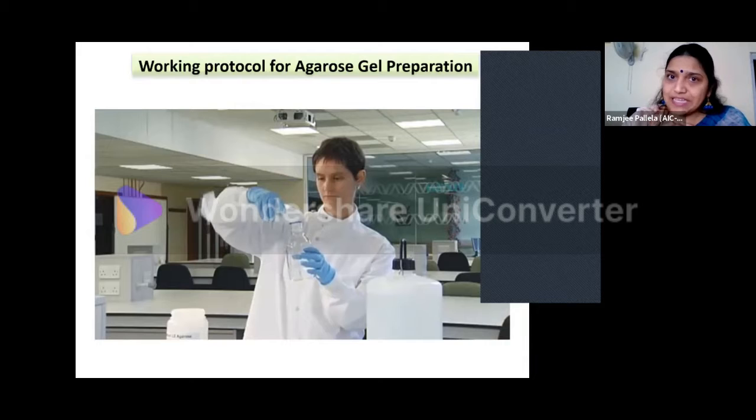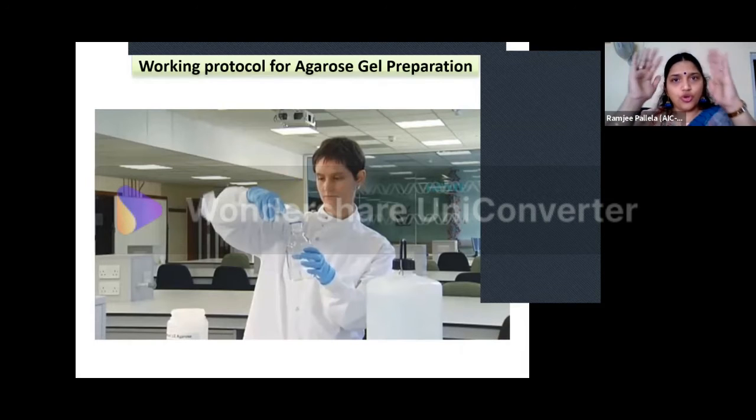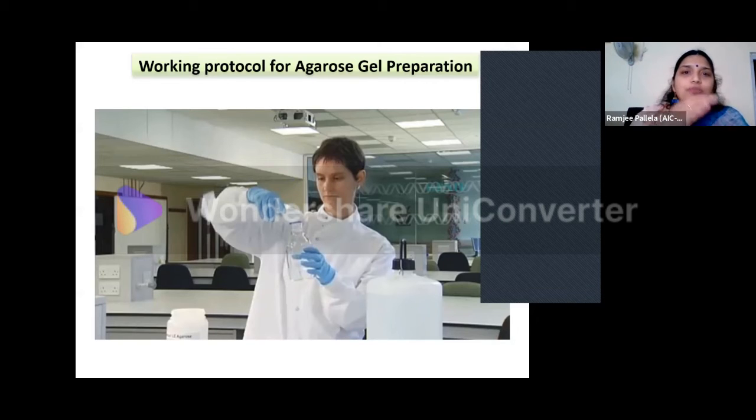Before you start any experiment, plan it. Okay, just make a table, plan everything. Oh, I should have brought my notebook to show it to you, but you just plan everything with it. And what are you expecting, what is the protocol you are going to follow, should all be there on that particular sheet of paper. Okay, and preferably in your notebook, not as a loose sheet. So when you put it there, you know exactly how much you have to weigh, how much you have to mix, and what you have to do.